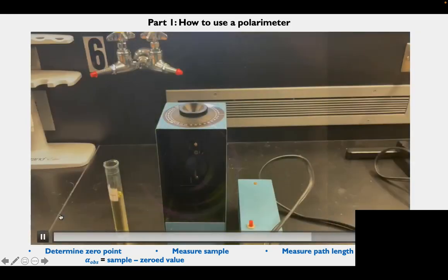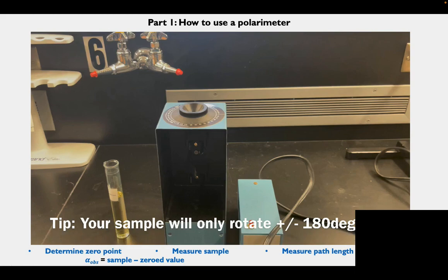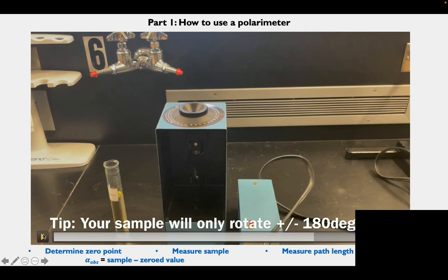So another mistake could also arise if you over-rotate or you rotate it in the wrong direction. So you just want to be careful if you've rotated past 180 degrees, because your light will only rotate plus or minus 180 degrees, and so over-rotating would mean that your rotation should have been in the opposite direction. So just watch out for this.